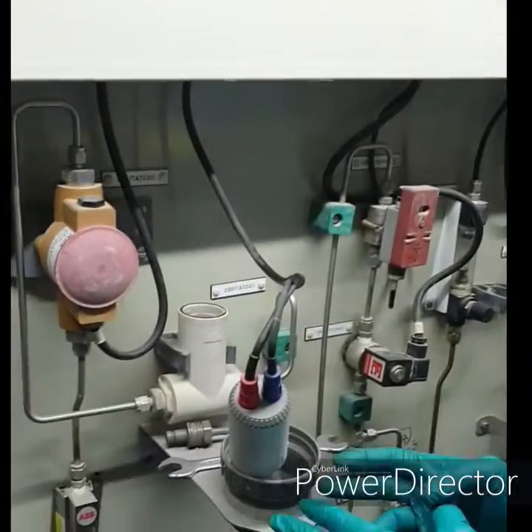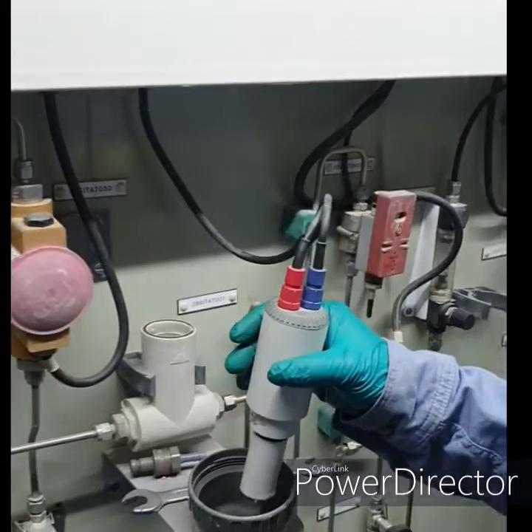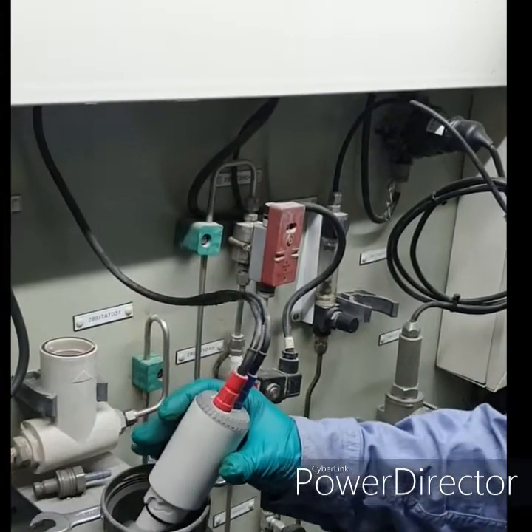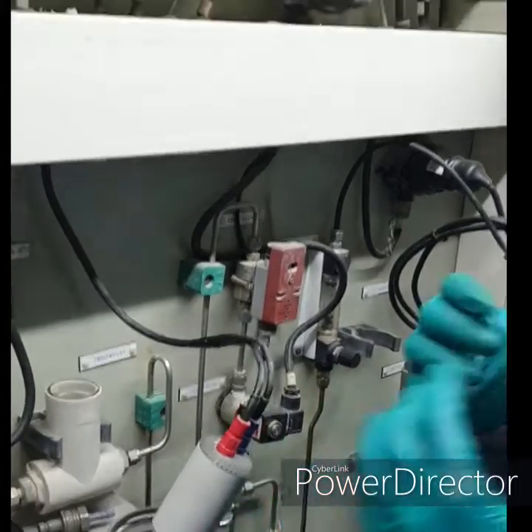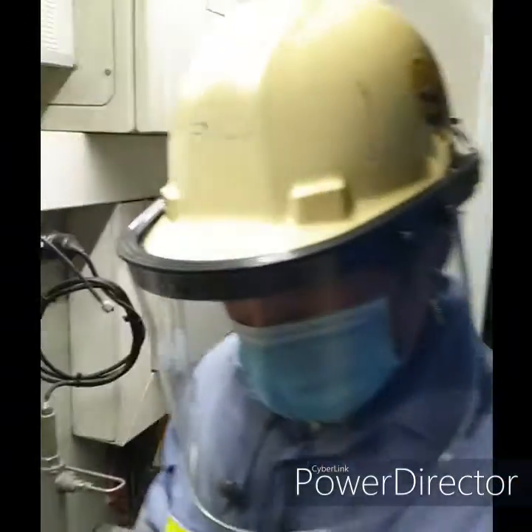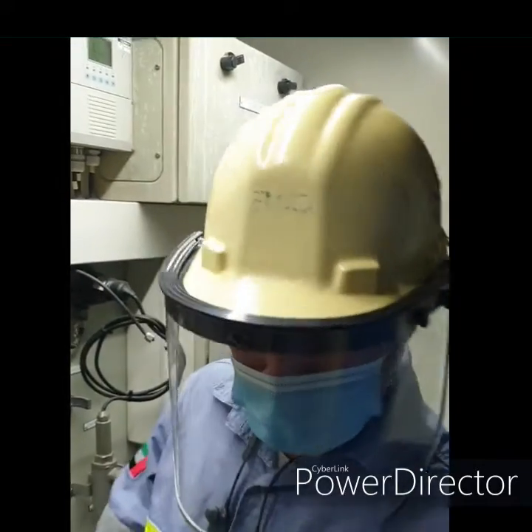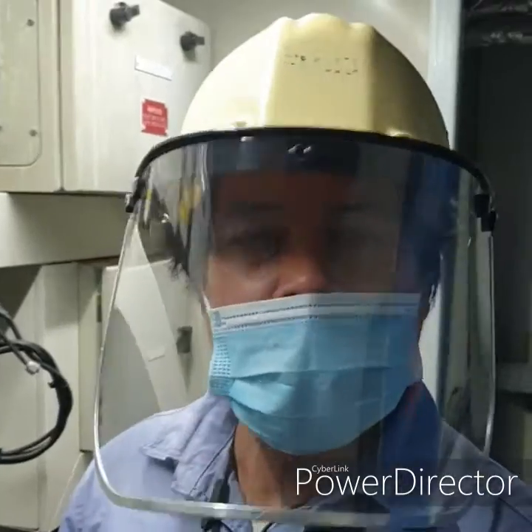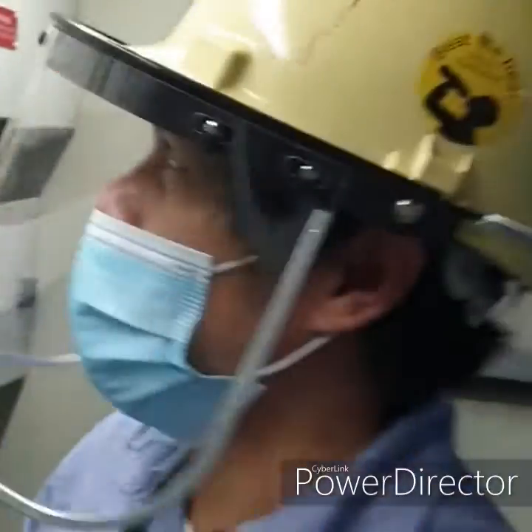First, we have our buffer solution. We will immerse our pH sensor into the buffer solution. Our buffer solution — at this point we are doing two-point calibration. We are using buffer 1 at 7 pH, and buffer 2 is 10 pH.